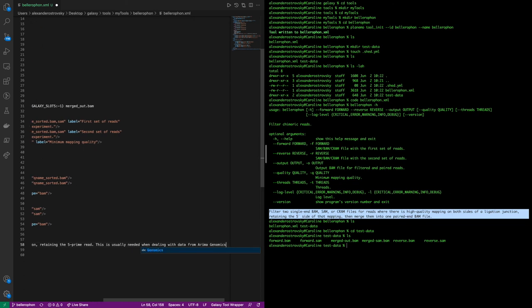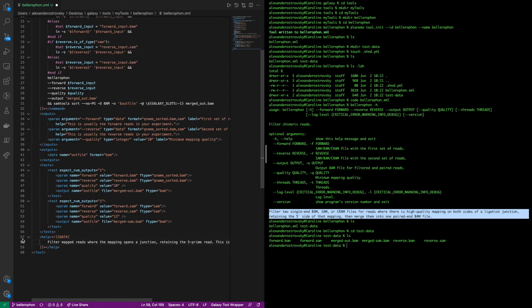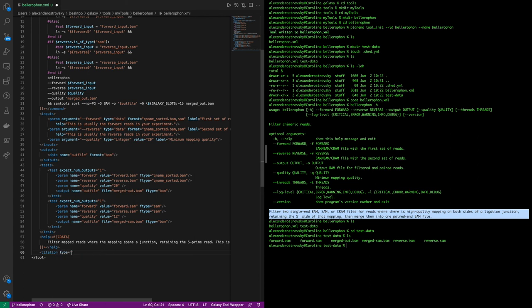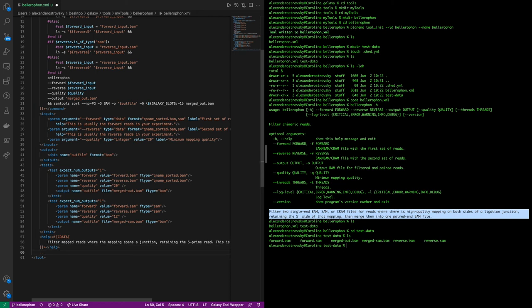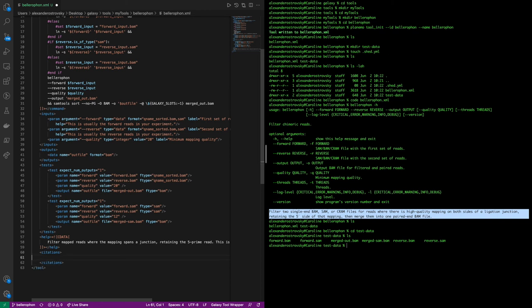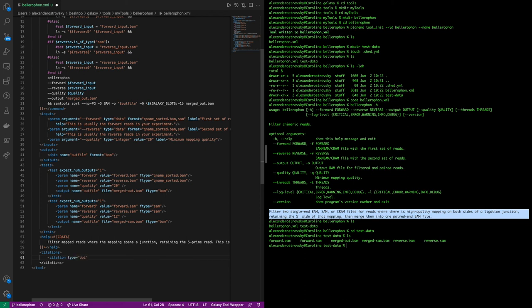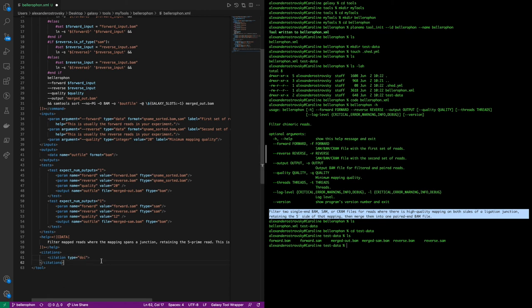Finally, we have the citation section, which allows us to very easily use either DOI or BibTeX format to link directly from the tool wrapper to all relevant sources for the tool. In this case, we will be citing the VGP paper for which this wrapper was generated. And we can simply copy and paste a DOI as plain text between the tags. For more instructions on how to use a BibTeX format, you can find that in the attached tutorial.